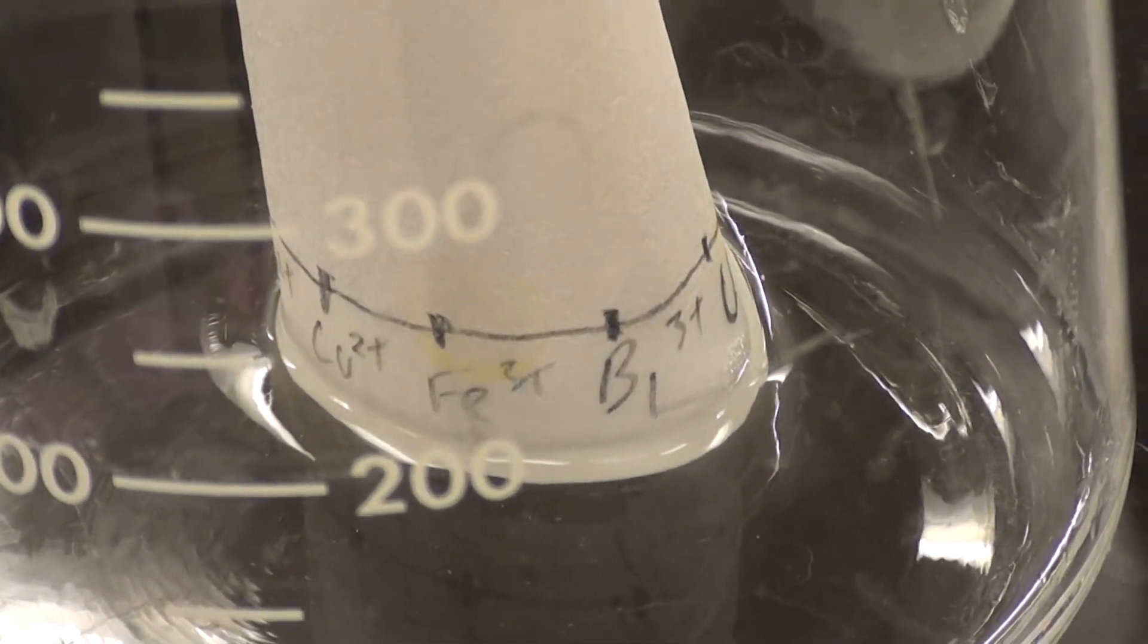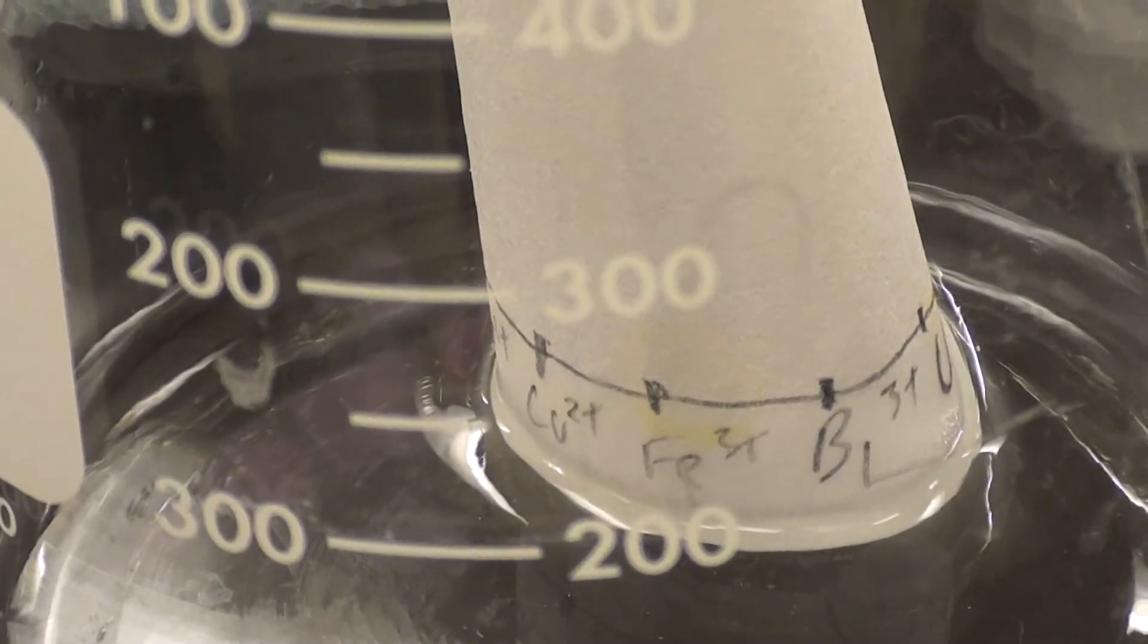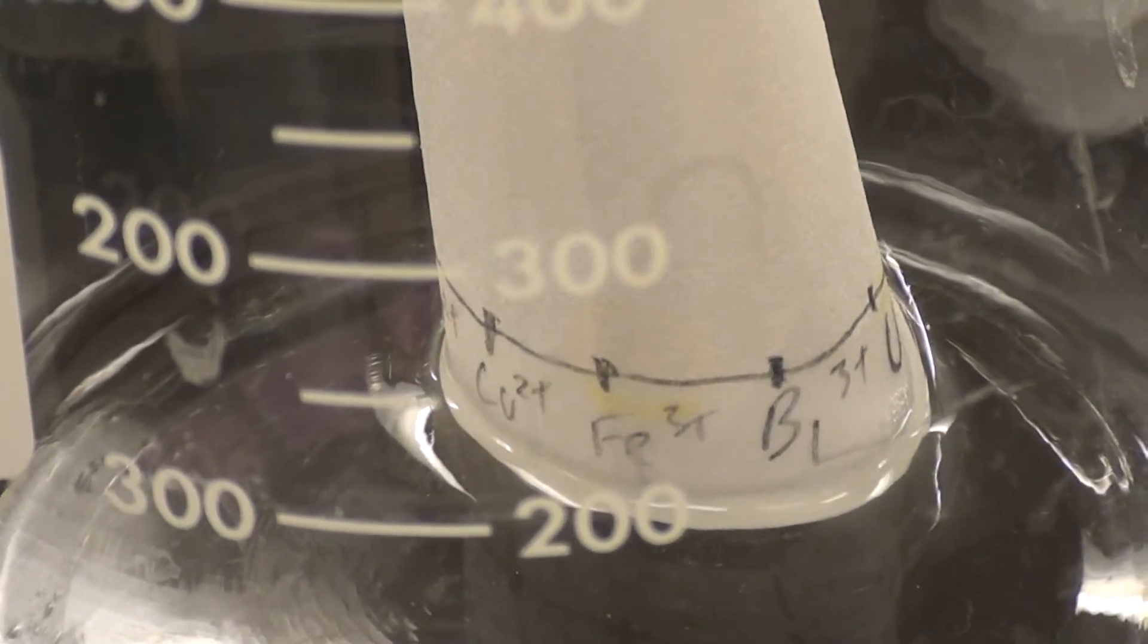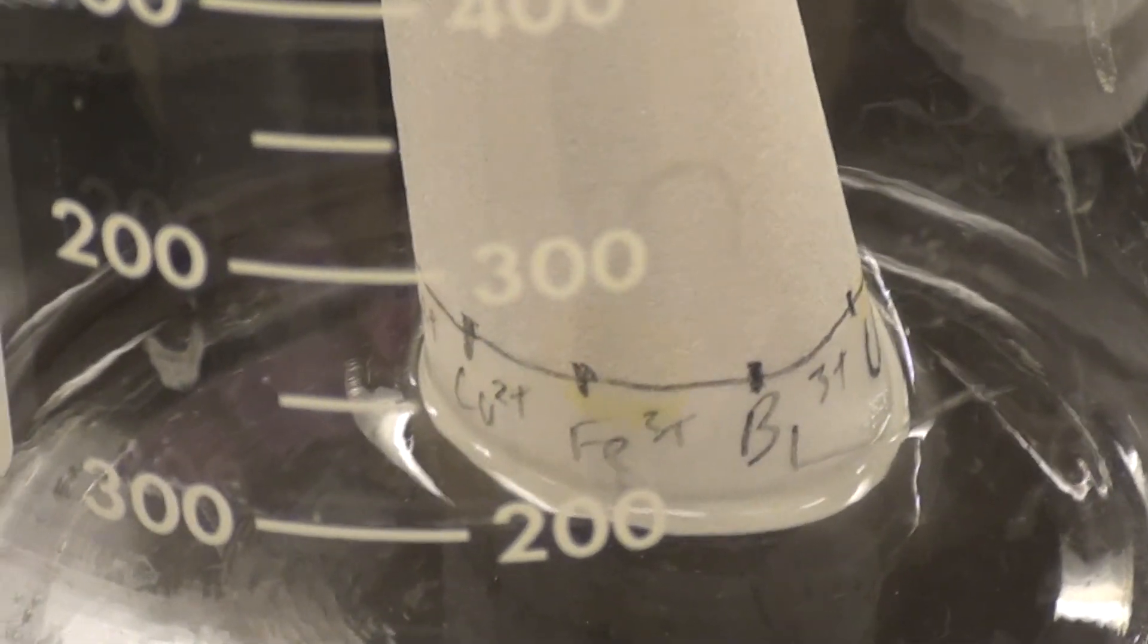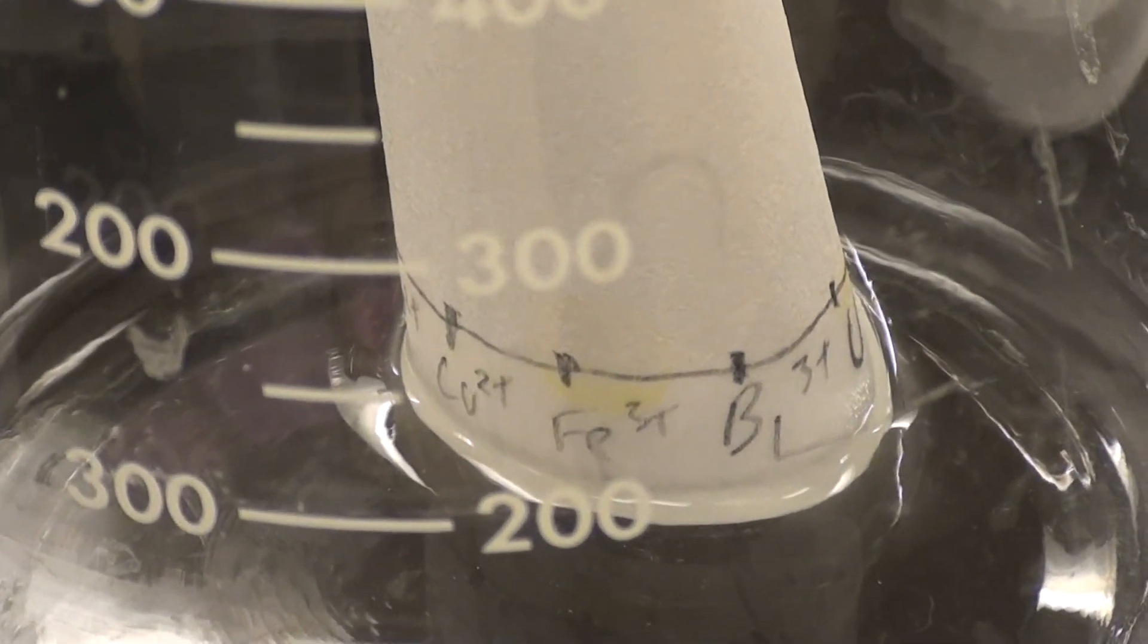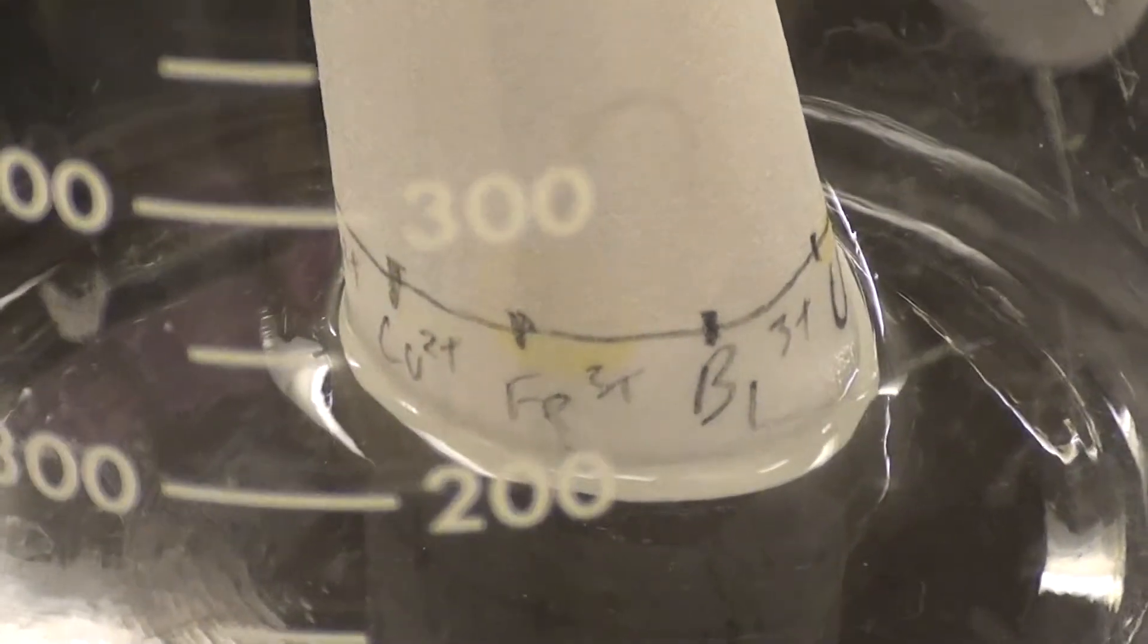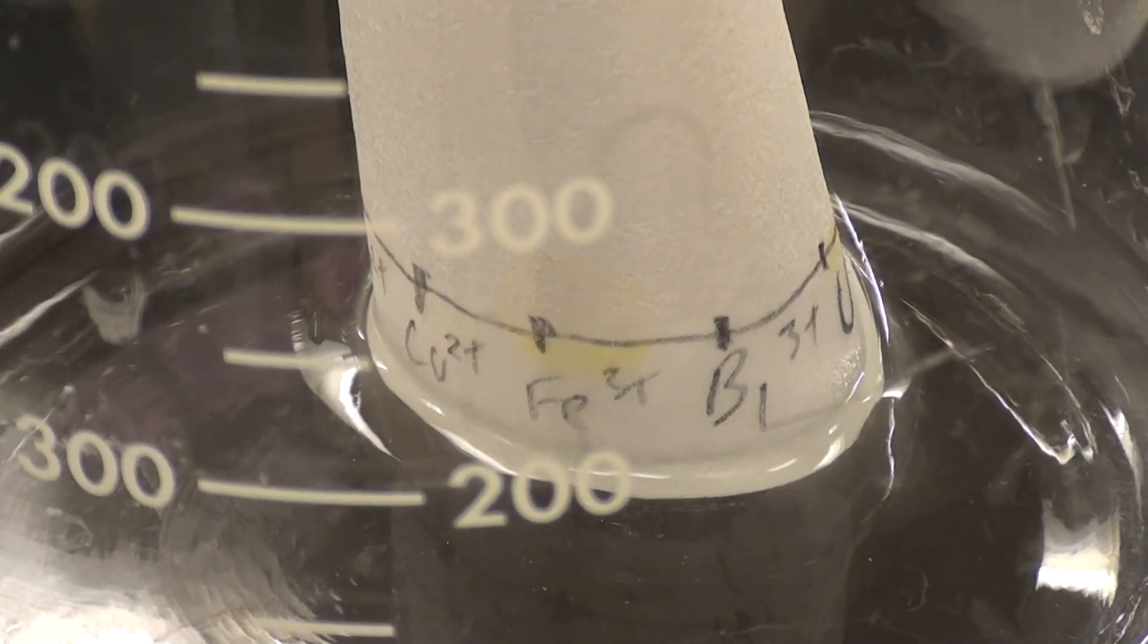Now what's going to happen is ideally we want to leave this in here long enough so that it reaches that top line, the line at the top of the paper. So I'm not sure that we'll be able to leave it in there that long, but we want to leave it in for as long as we can to let this go as high as it possibly can and we get the best separation of our ions and the best RF for our spots that we will calculate later on. Alright, I'm going to leave it there for now and we'll come back to this once it's come up the plate a bit further.